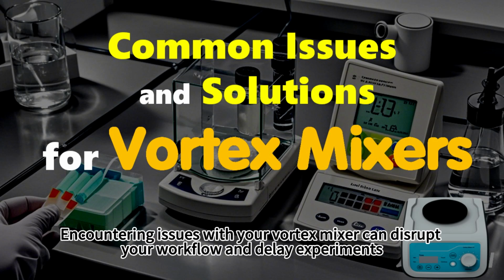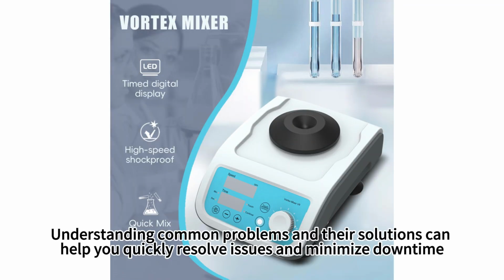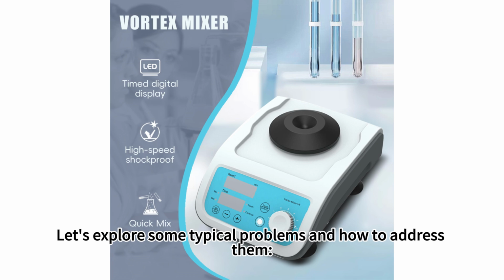Encountering issues with your Vortex mixer can disrupt your workflow and delay experiments. Understanding common problems and their solutions can help you quickly resolve issues and minimize downtime. Let's explore some typical problems and how to address them.